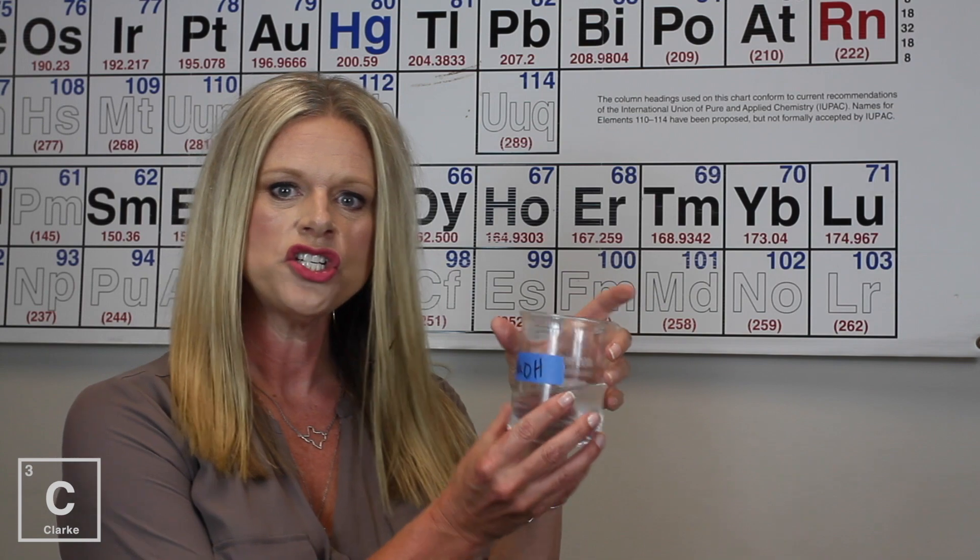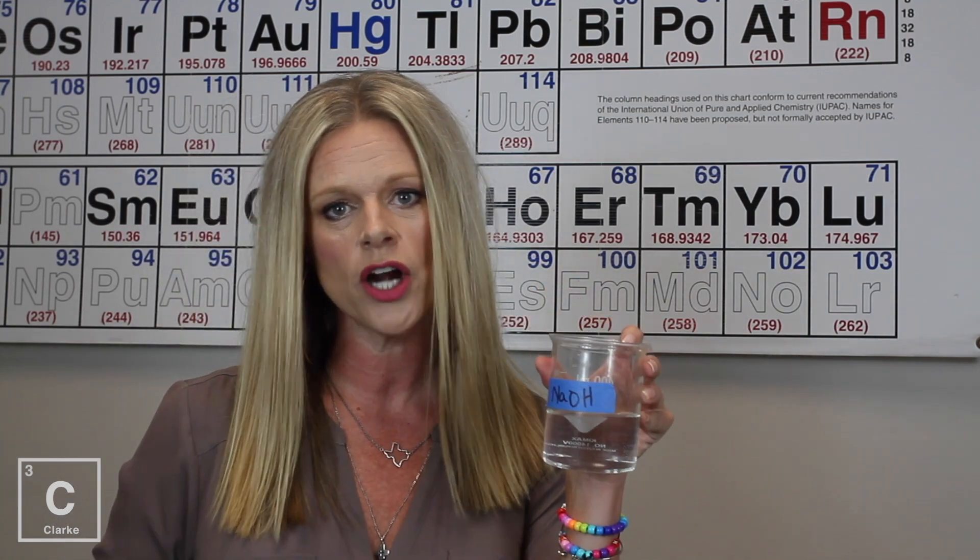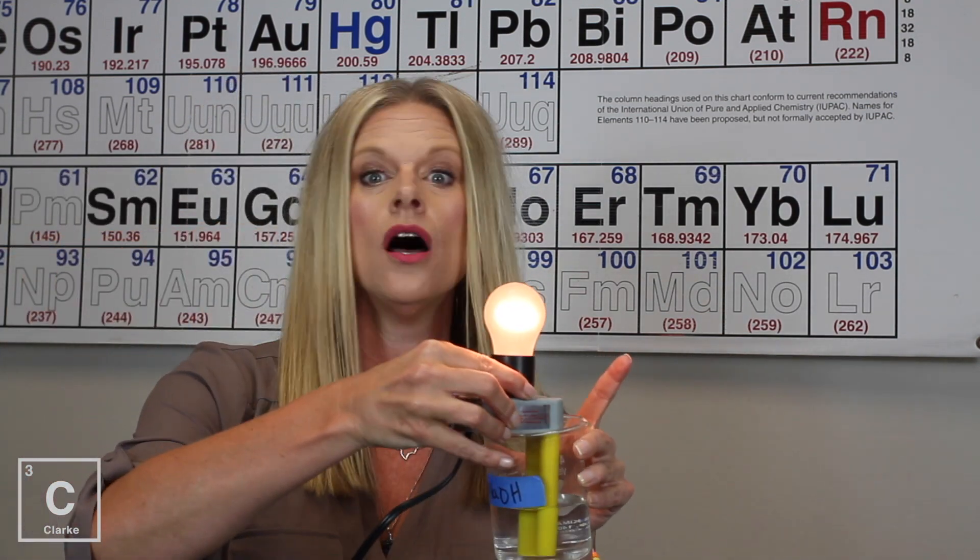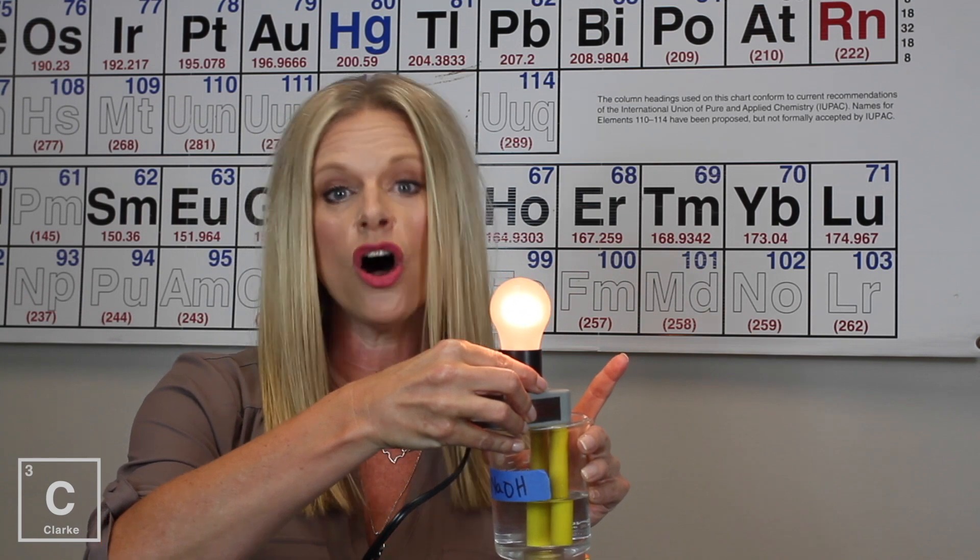So I've got NaOH. OH, that means when it dissolves in water, it's going to increase the concentration of hydroxide. I have my conductivity tester here. Sodium hydroxide, that is also a good electrolyte. Again, let's remember, electrolytes conduct electricity because they completely dissociate in water and release those charges.